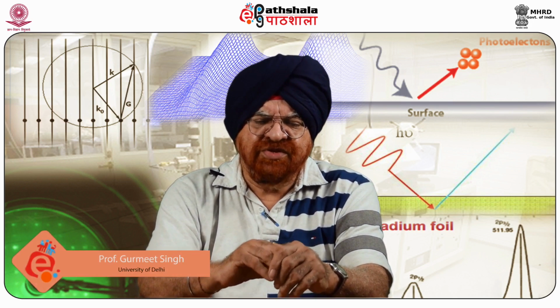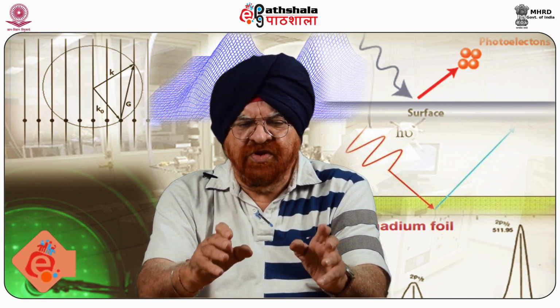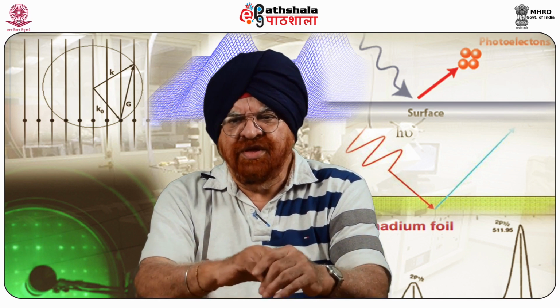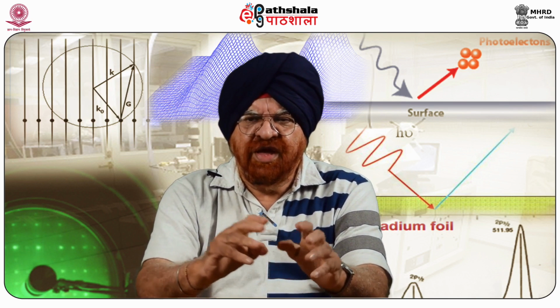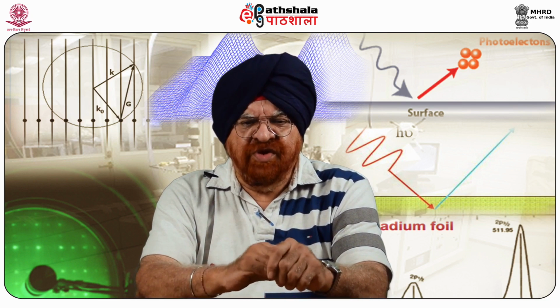So this module will explain how useful the XPS spectrum is for analyzing the elements present on the surface and the amount of these elements present on the surface. Thank you very much.